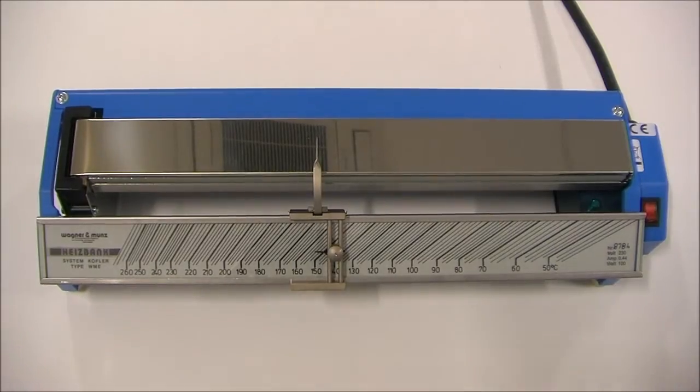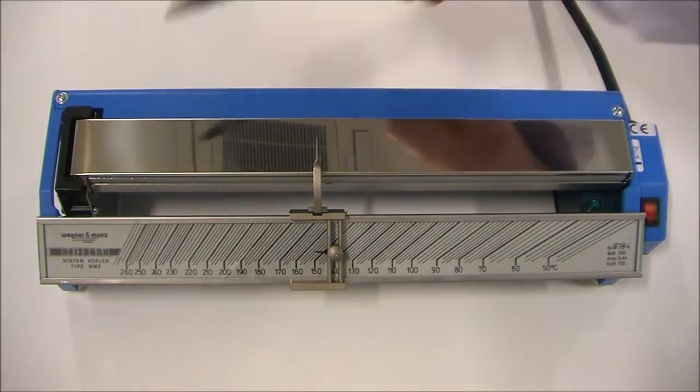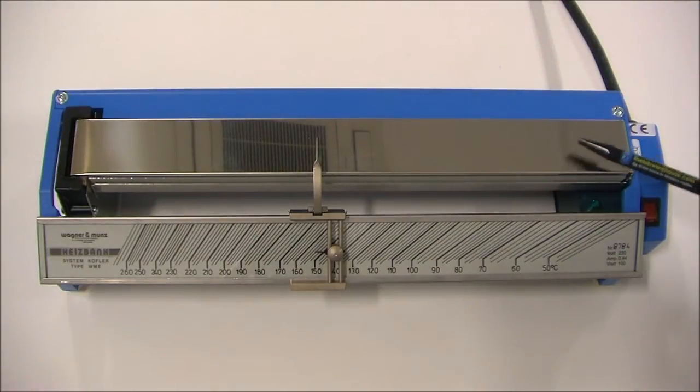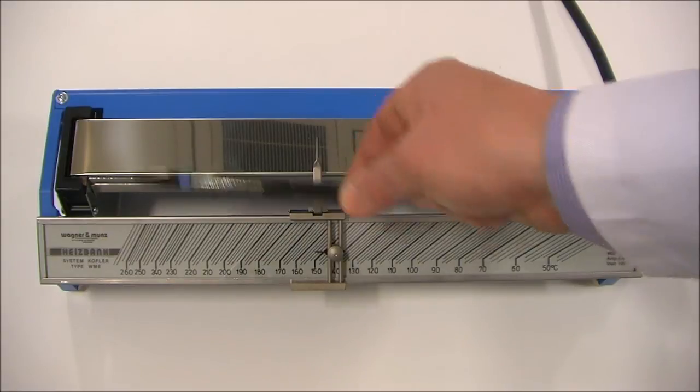The Koffler Hot Bench works like this. This section here is a graduated hot plate. The temperature range is 50 degrees C at this end, up to 260 degrees at this end.